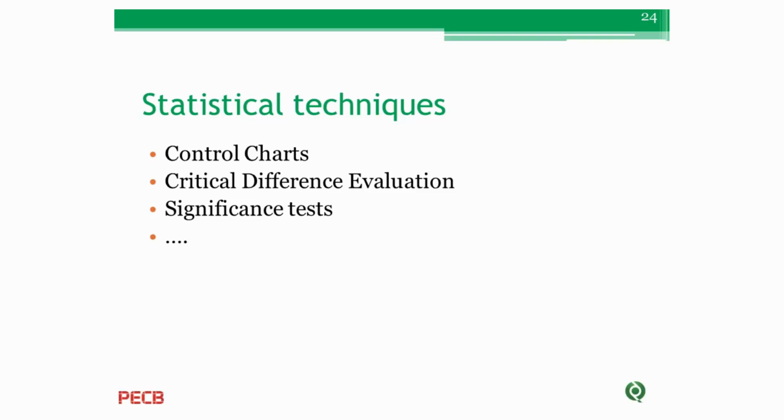The statistical techniques which can be applied, as I mentioned, are the control chart, the graphical tool, critical differences evaluation, the difference between two replicate test results, and significance tests such as the t-test and F-test. If you're interested, you can search more for these terms and see how you can apply those techniques in your laboratory.